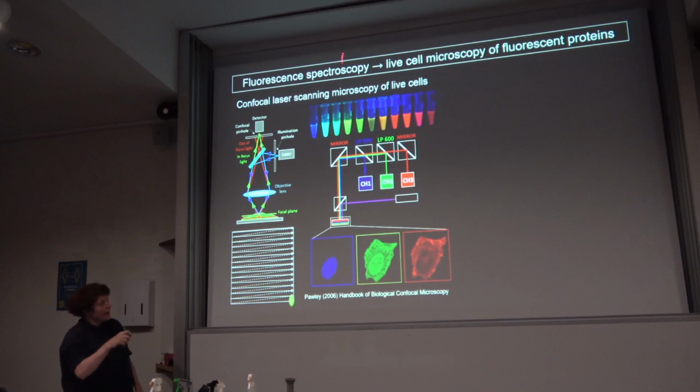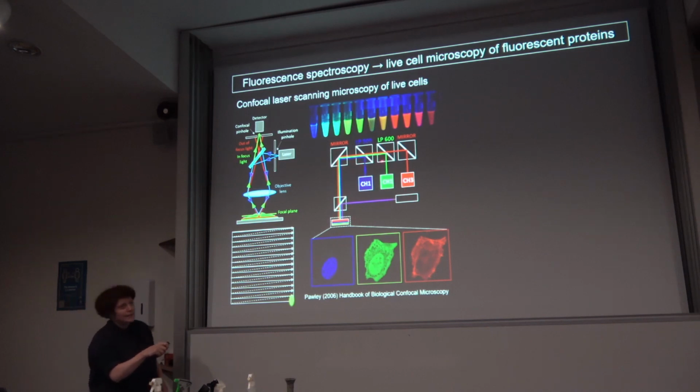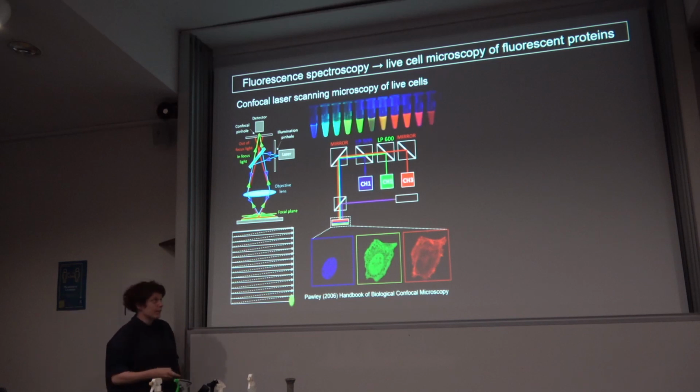So if I had a sample that was stained with something that was fluorescing blue and it expressed something that's fluorescing green and red, I could set up a laser that excites the blue fluorescence, the green fluorescence, the red fluorescence, and then that signal would be sent up to where my detectors are. And by using different filters, like I did for the painting, I could direct the blue fluorescence into one channel, the green fluorescence into another channel, and the red fluorescence into a channel, and look at where these different fluorophores are located in my sample because of this raster scan on the microscope.